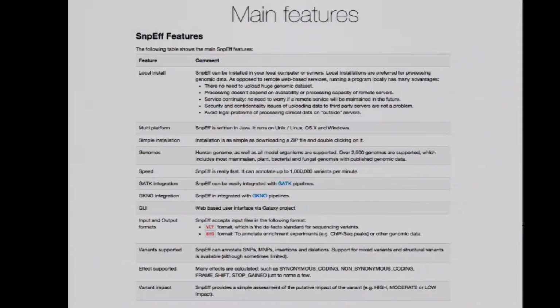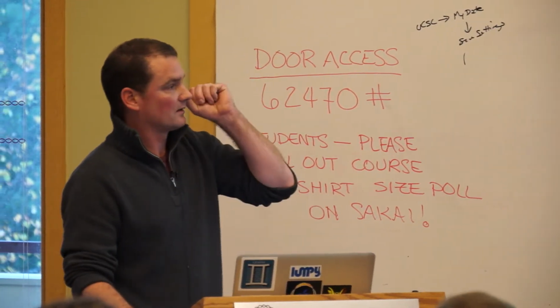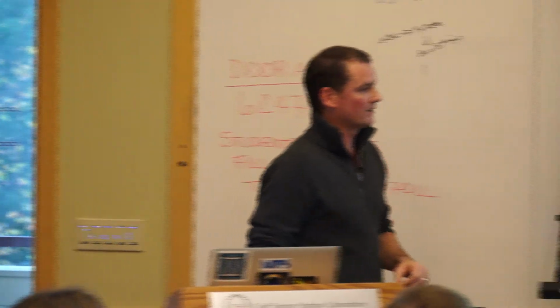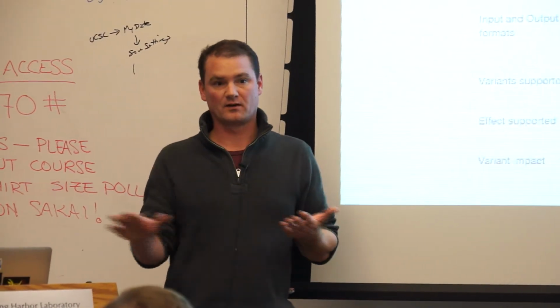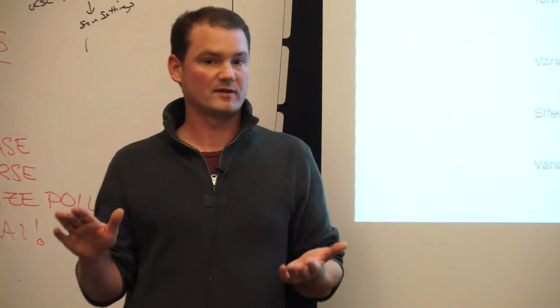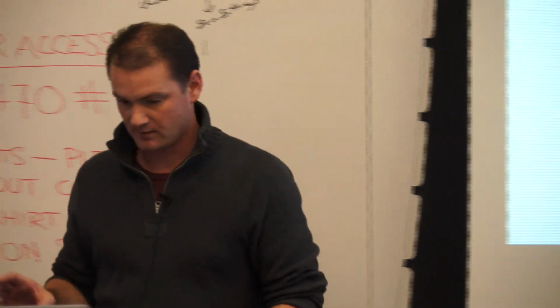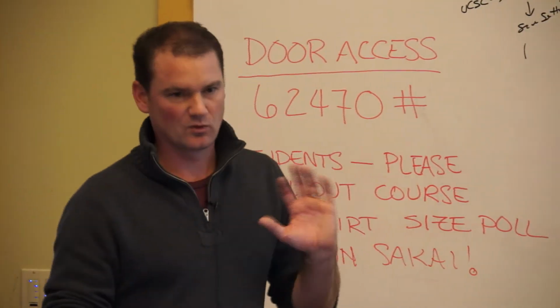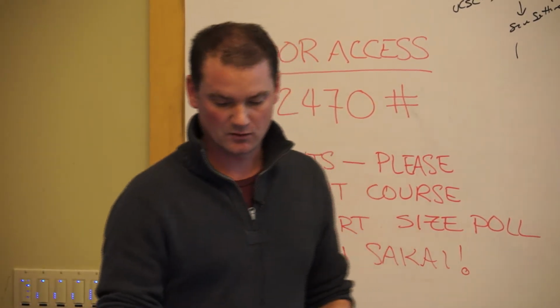The other main reason to use SnpEff, especially if you're not studying human, is that Pablo Cingolani, the guy who develops this, has done a ton of work to collect all the annotations to be able to do these types of predictions essentially for any species whose reference genome has been sequenced. So it'll work for any model organism or species that you're working on. VEP is a little more tuned. It's not exclusive to human, but it's really most well suited to human.